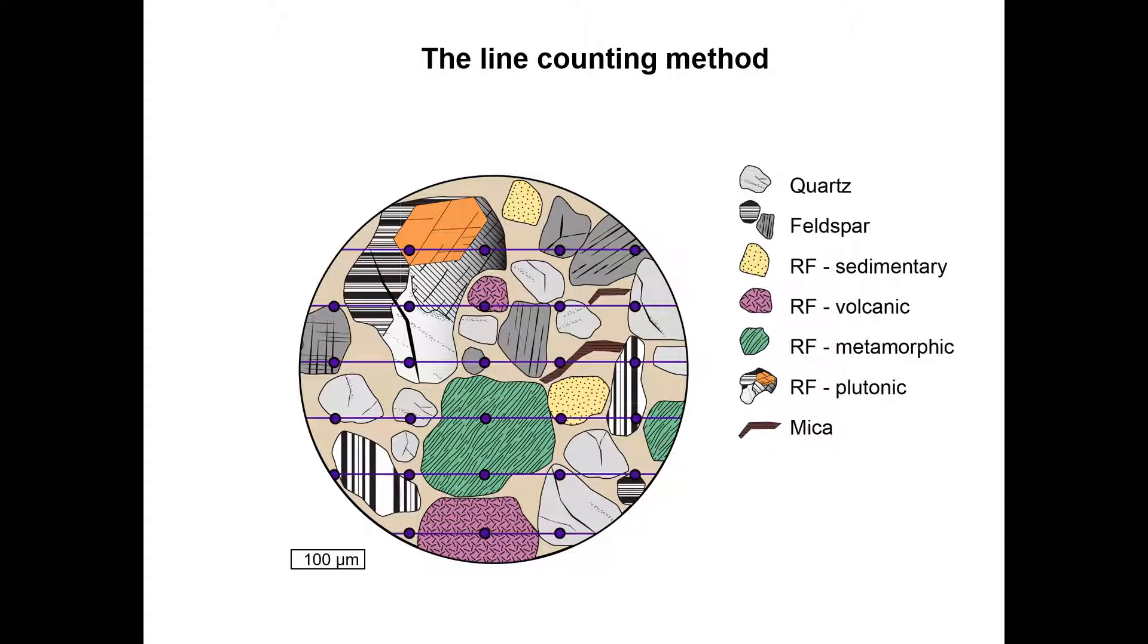This method can be susceptible to grain size bias because larger grains like this one can be counted multiple times whereas smaller grains might not be counted at all.